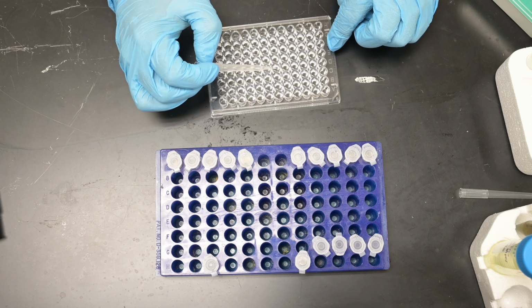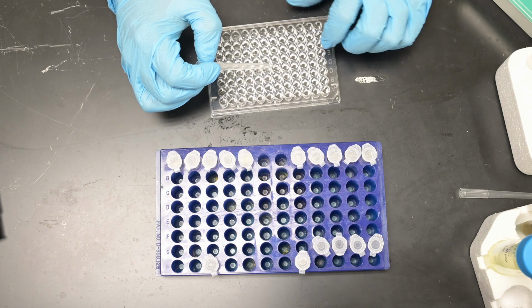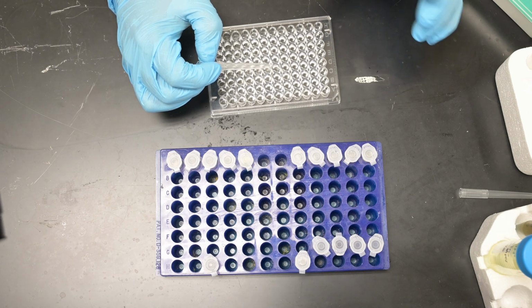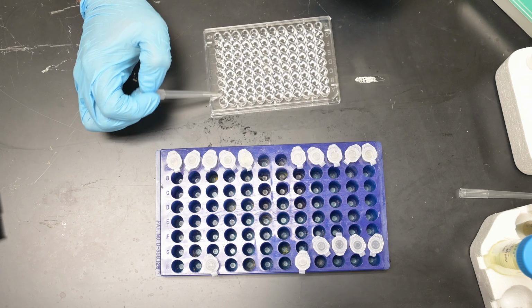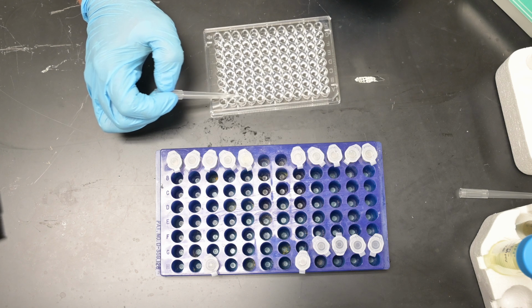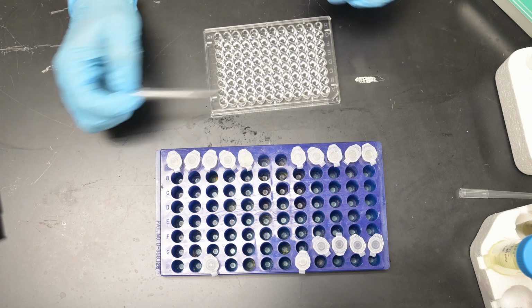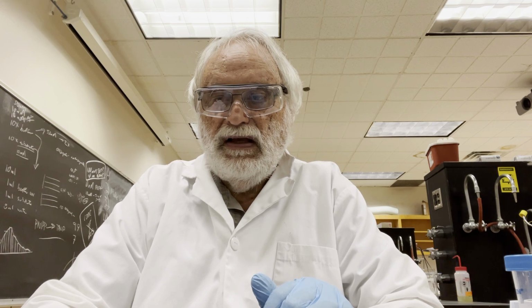I'm not sure if this will give us a significant amount of information or not. I haven't done the assay enough to really know, because I've been told that it sometimes happens. And we have the enzyme kinetic samples, 20, 10, 5, 2.5, 1.25 across here, with wild type and mutant enzyme. Okay, so let's go ahead and get started.